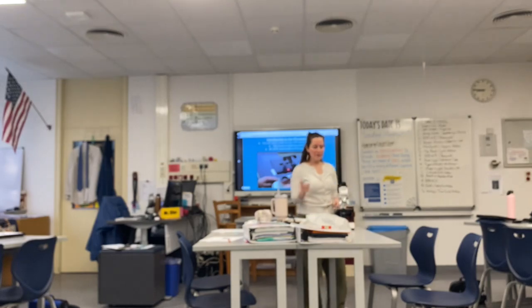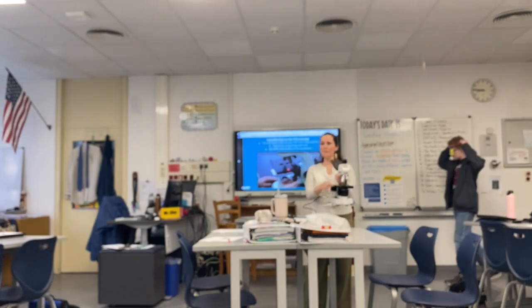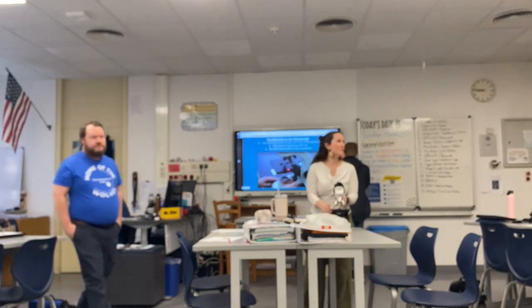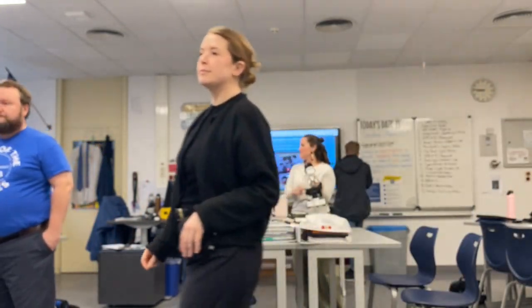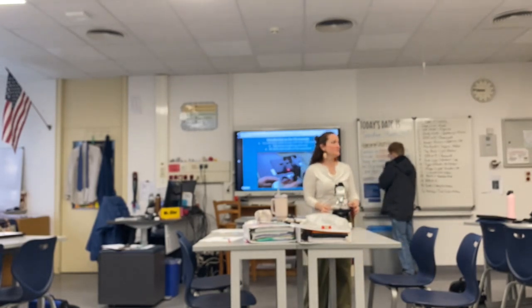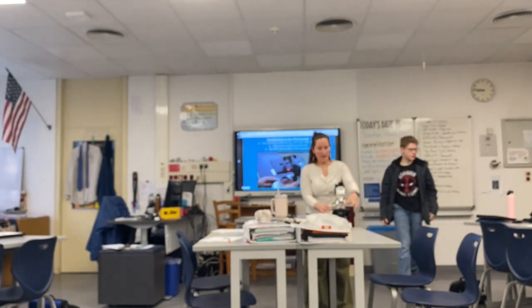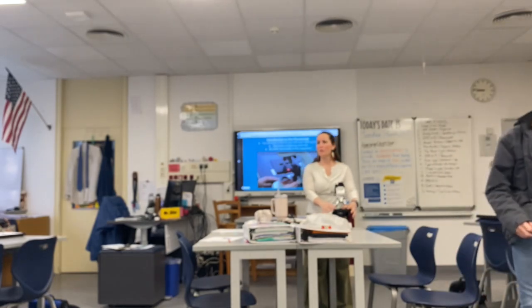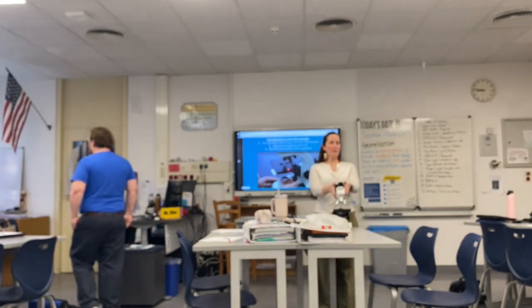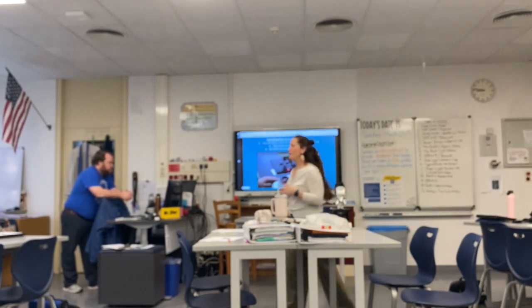Now everybody, do me a favor and touch this clamp right here. Everybody look at this clamp. This opens your stage so that you can put your slide in. Everybody put your slide on your stage while you hold this open. Once you put your slide on, you release it and that will hold it in place. Make sure that when you are looking at your microscope, you can read the E. The E should be facing you.